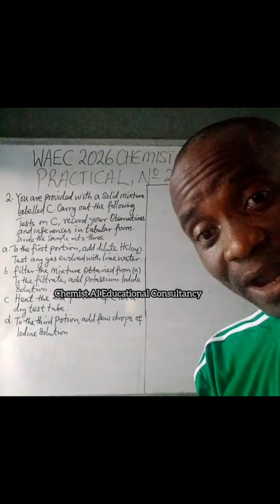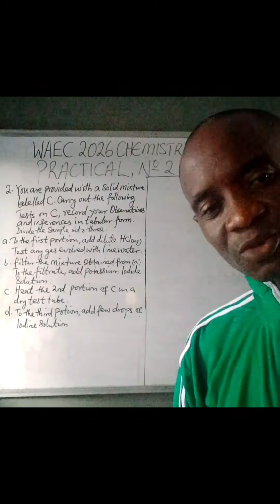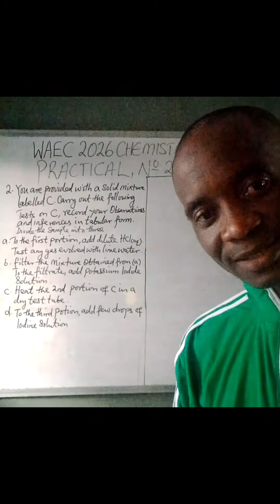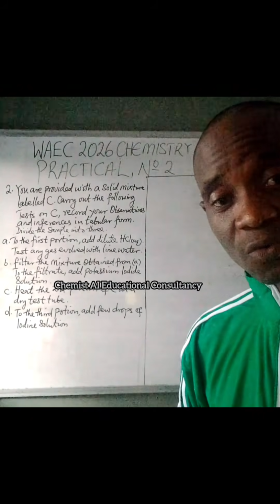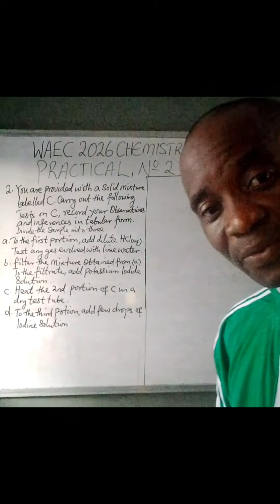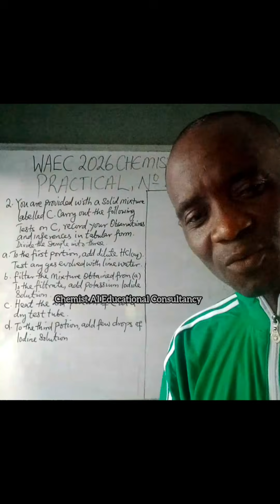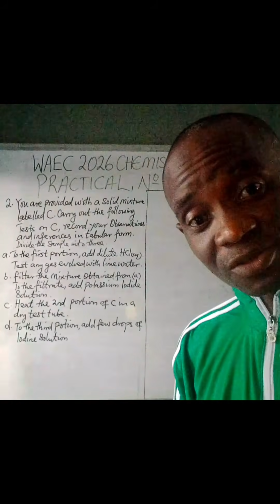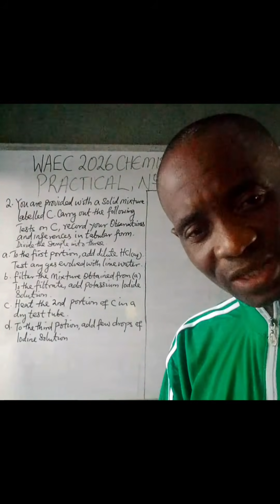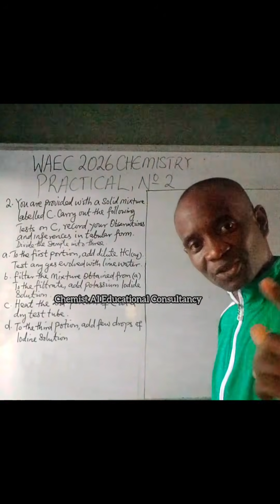Hello viewers, this is WAEC 2026 Practical Chemistry number 2. This number 2 is the salt analysis part of the practical, or what is generally called qualitative analysis. Now, I am here to teach you how to solve the question, because practical questions are more or less instructions to be followed. And if you follow the instruction as directed by the examiner, then the sky is your limit. Now let us move into the question.